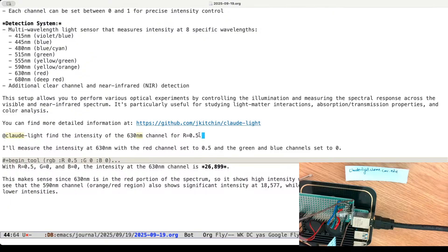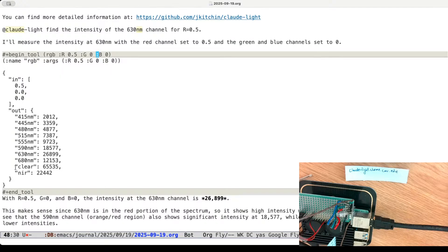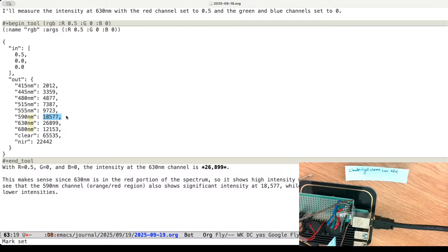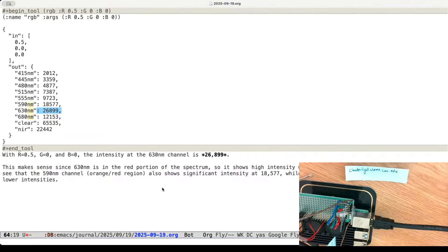If we look at what happened in the tool call, this is the JSON that comes out of the measurement — here's the actual JSON returned from clod-light, and down here a textual summary. It tells you this makes sense because we looked at a red LED and turned on a red channel. There were some notes about significant intensities at 680nm and 590nm being higher than expected — that's because my red LED is not super pure and has a spectrum that overlaps.